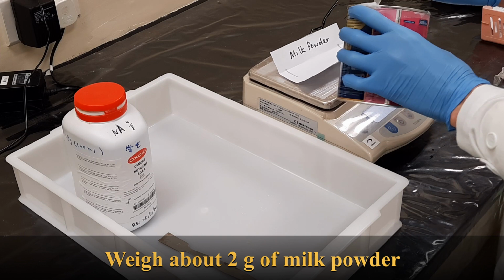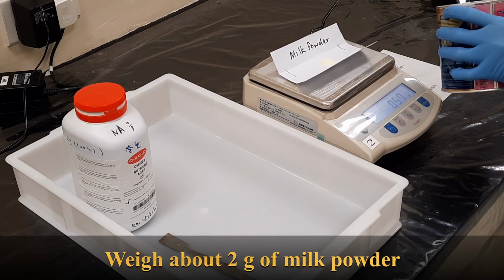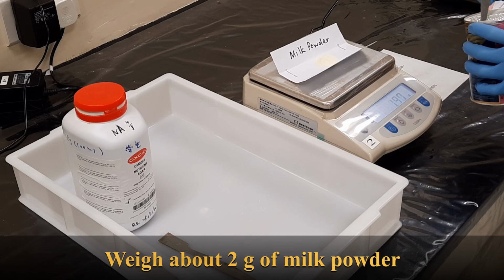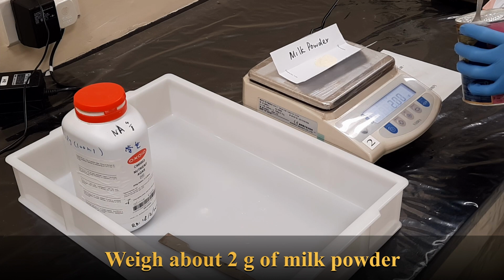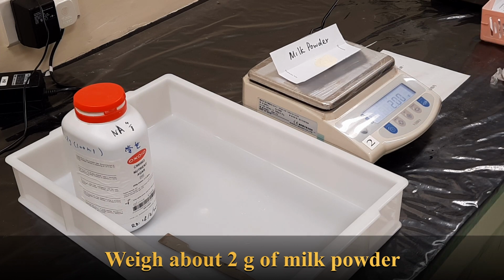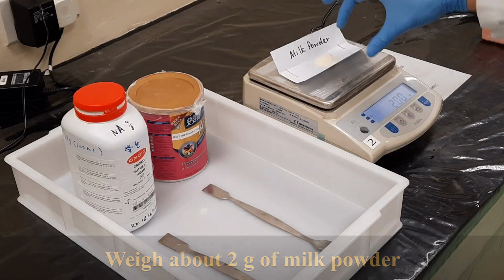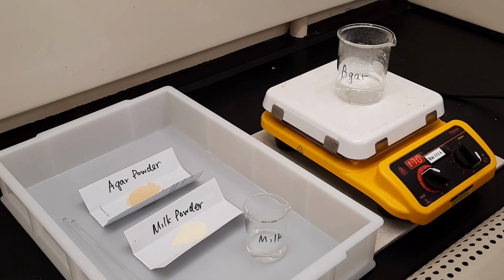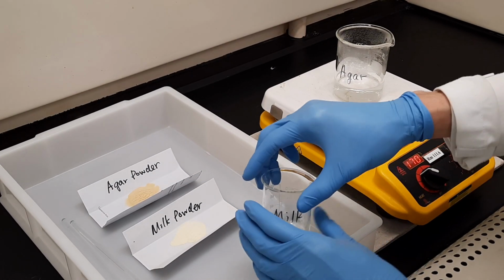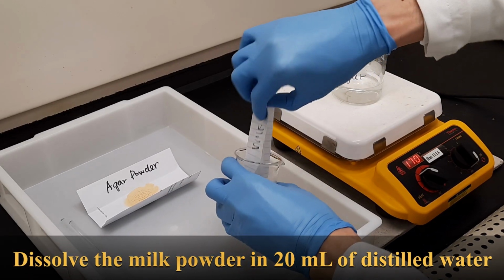Weigh about 2 grams of milk powder. Dissolve the milk powder in 20 ml of distilled water.